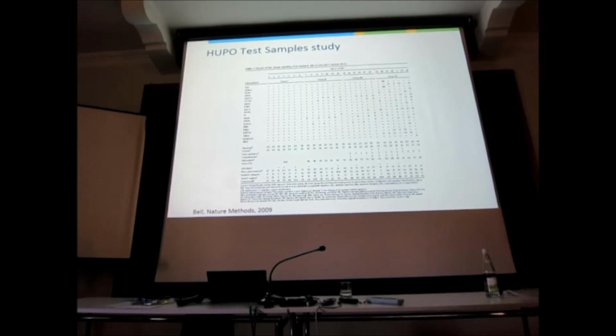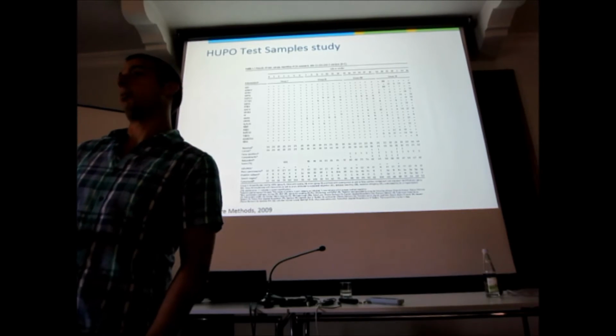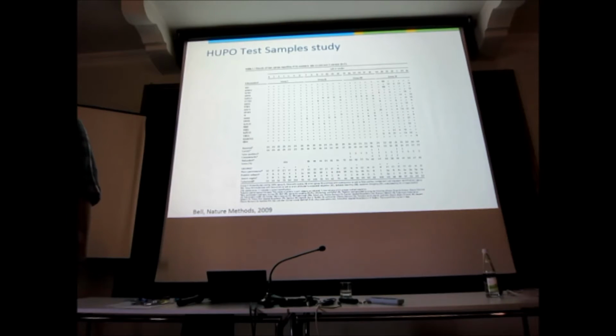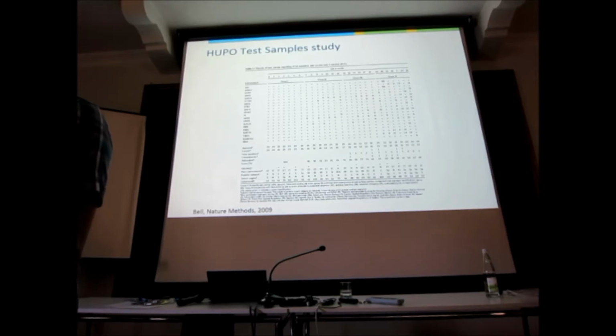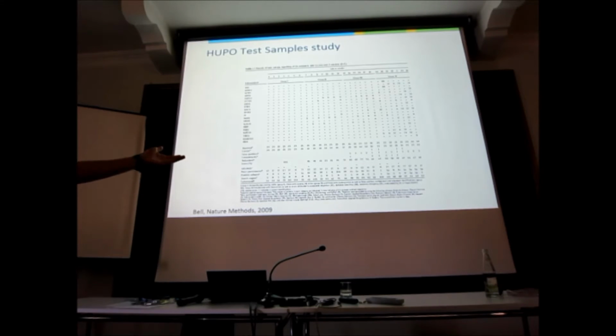The only useful thing in this table is these TR entries, which is where Eric Deutsch, who analyzed this data in detail, found out that there was a trypsinization problem. And that's a very easy quality control that everybody can do. Search your data with 0 miscleavages and search it with 3 miscleavages, and count how many peptides you get with multiple miscleavages. If you have many with 2 miscleavages, by usual standards, your protocol was bad. Okay? Your trypsinization went wrong. It's a super easy test to do. And you have the data anyway. A search takes only a few minutes. Anyway, this was an attempt. I think I should label it as an abortive attempt.